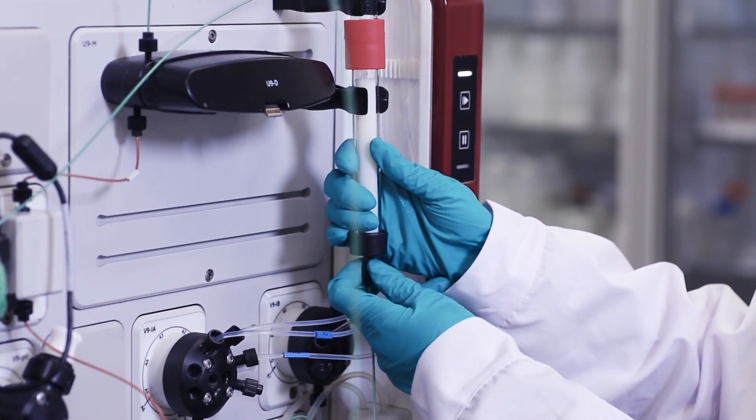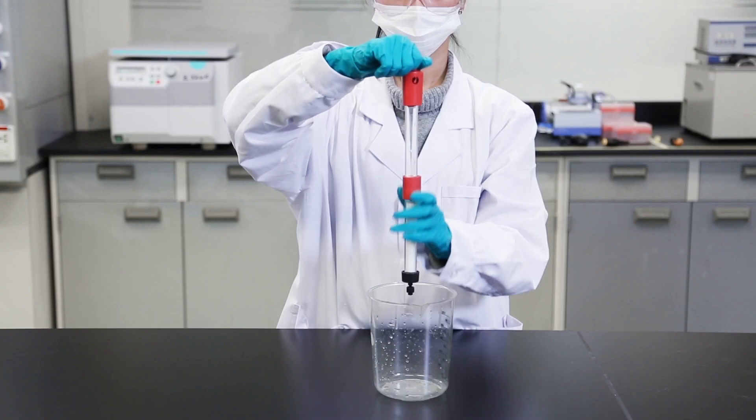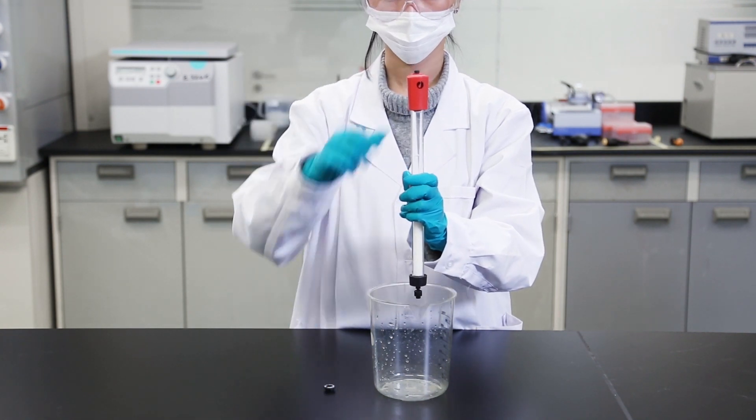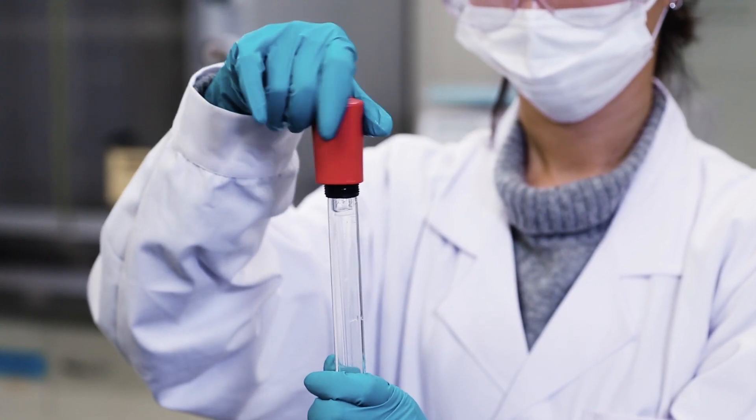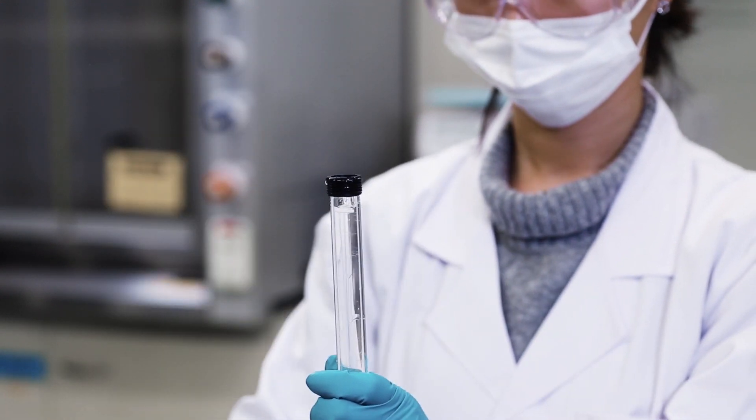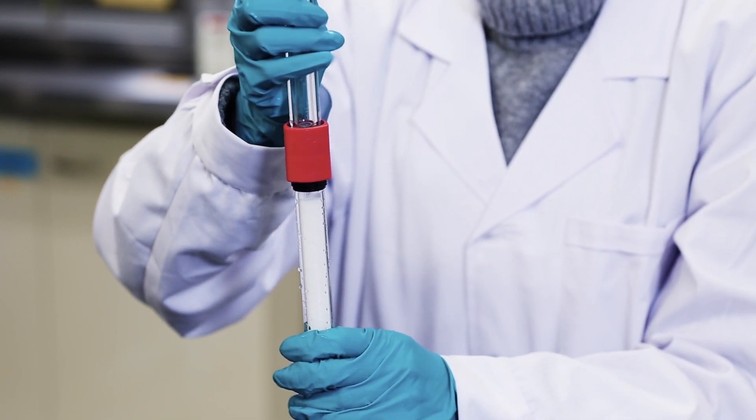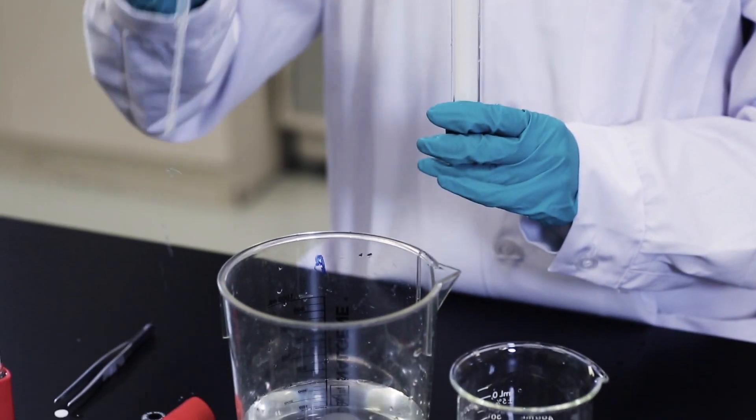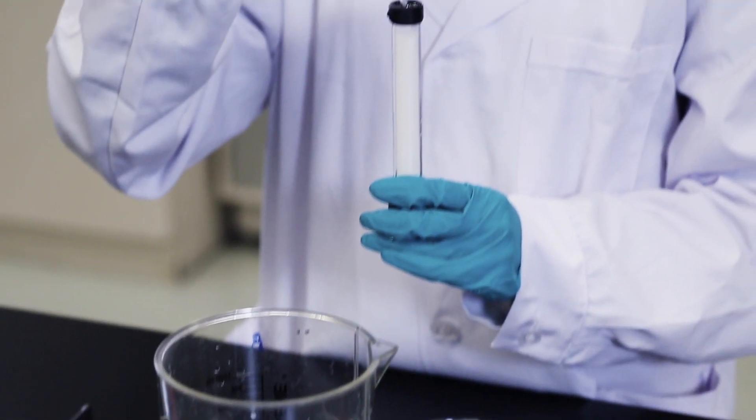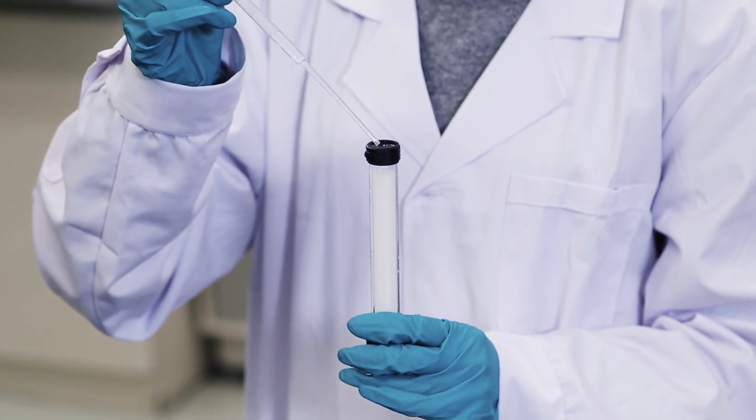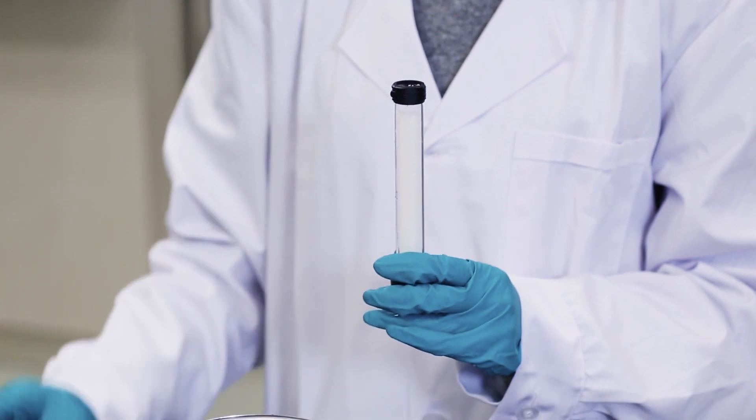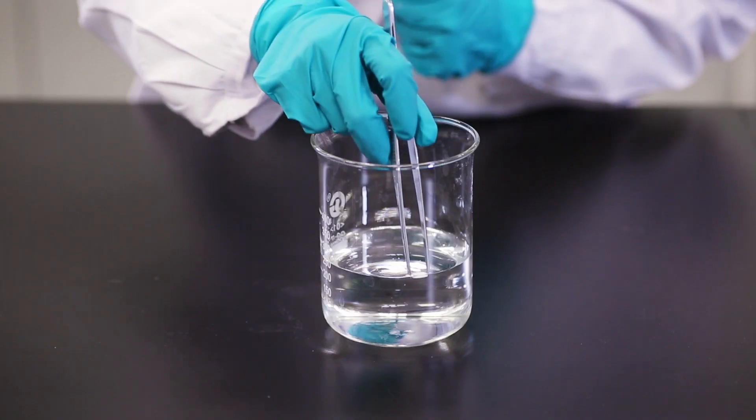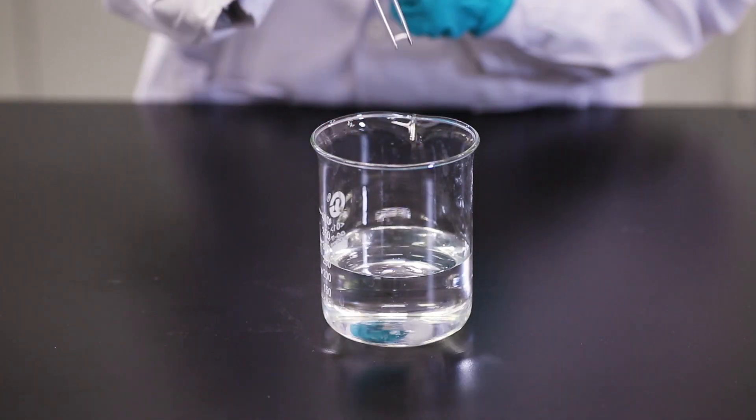Remove the column from the stand. Detach the column from the reservoir over a beaker. Remove the filter and add some packing solution to the top.